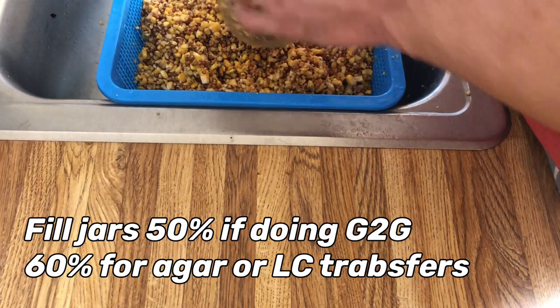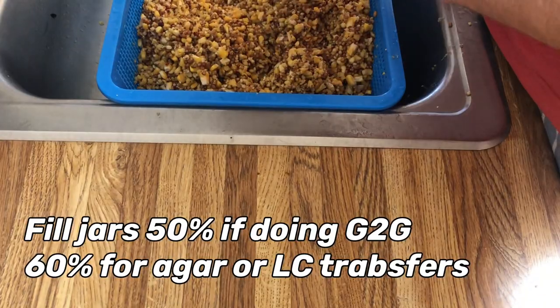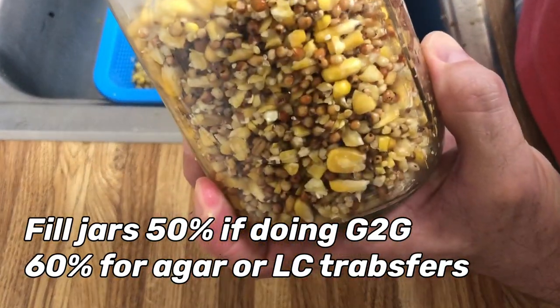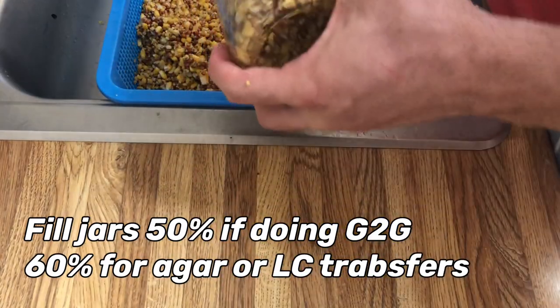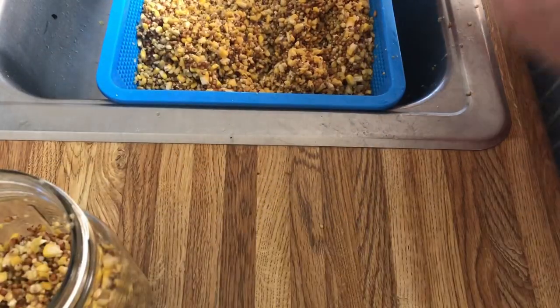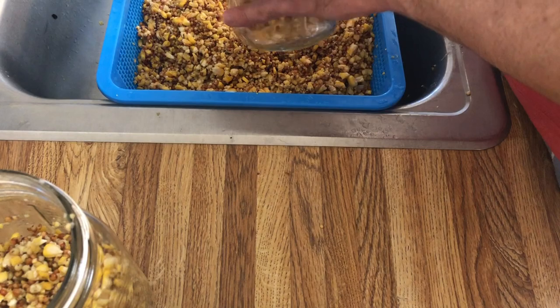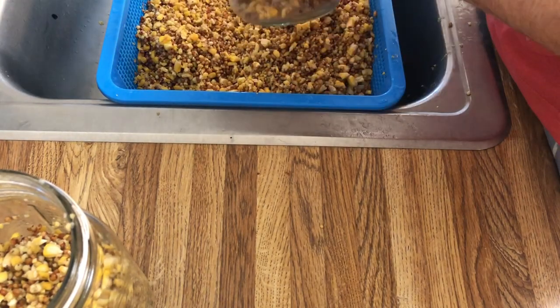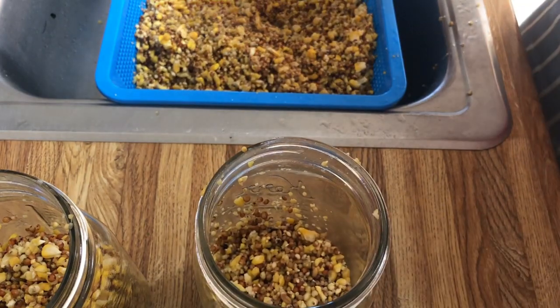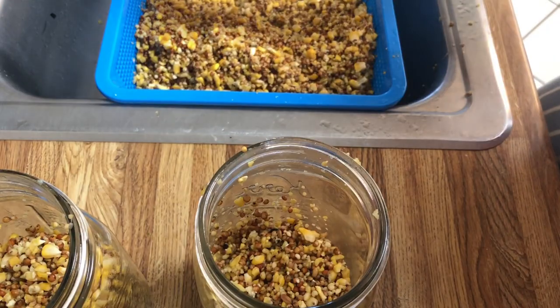So I think I'm gonna do grain to grain transfers on most of these jars. So what I'm gonna do is fill them up about 50% of the way. Because you gotta remember, when you pressure cook these, the grains will still expand a little more. So if you fill them up to 50%, they'll be, you know, 65, 70% full by the time they're done. And then you're gonna have to pour some grains in there, so it'll fill it up a lot, and you don't want it to be too full, otherwise you won't be able to shake your jars.